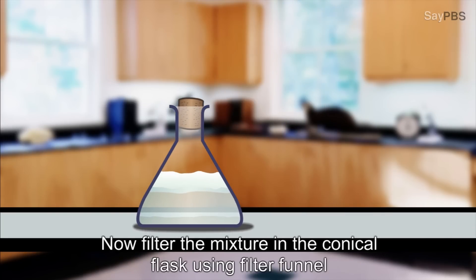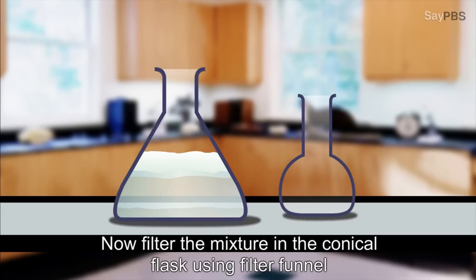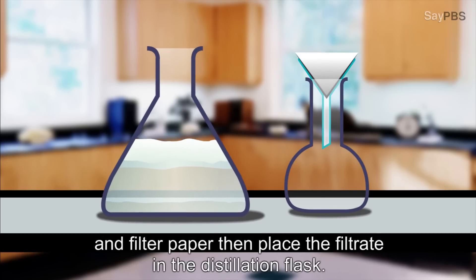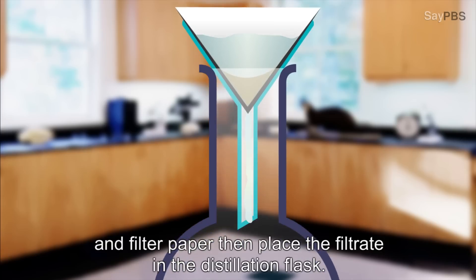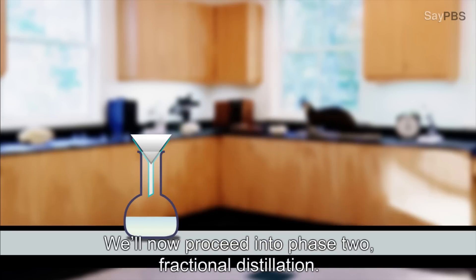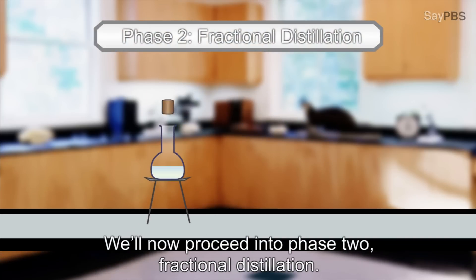Now, filter the mixture in the conical flask using filter funnel and filter paper, then place the filtrate in the distillation flask. We will now proceed into phase two, fractional distillation.